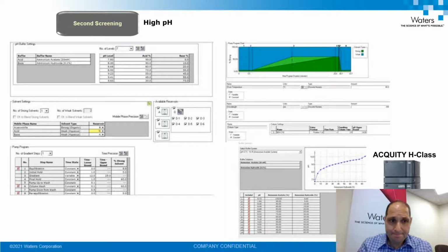So the first issue I wanted to address is the formoterol peak shape. To address this issue, we made an adjustment to the design of experiment. This adjustment was using high pH aqueous mobile phase buffers. The reason for this adjustment is the fact that formoterol is a base, and it would be logical that high pH mobile phases could help improve the peak shape of this analyte.